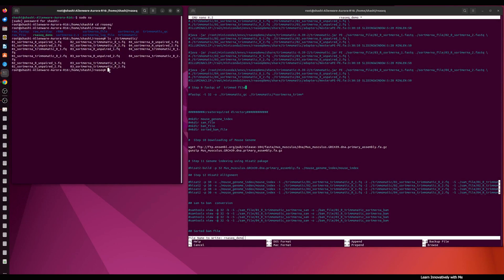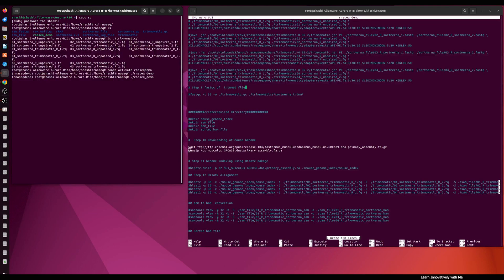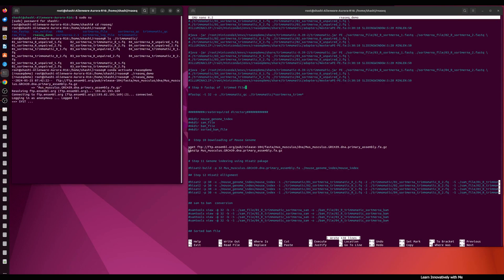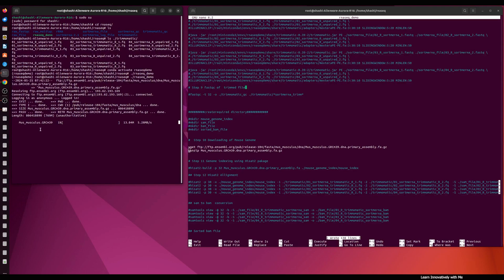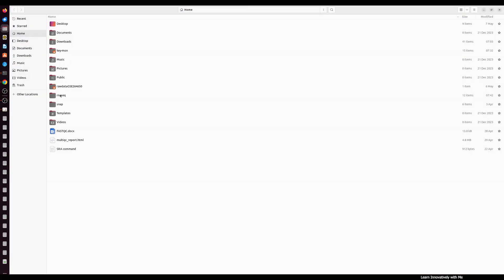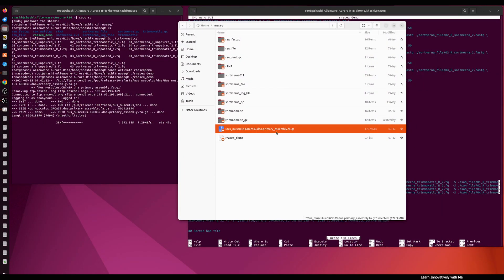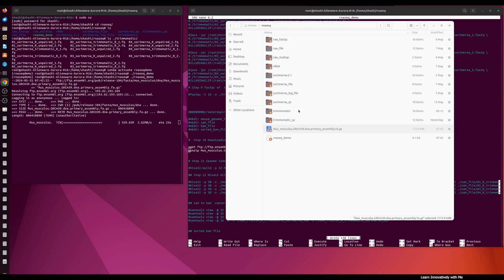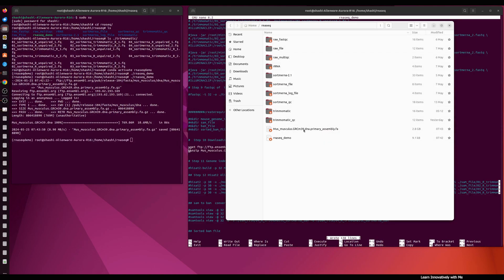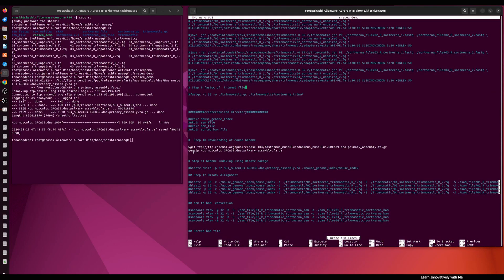First I'm going to activate the conda environment using the command 'conda activate demo' to run the script. You can see the reference genome is downloading. We can check the directory and the reference genome for mouse is downloading right now. The file is downloaded and unzipped because we put the gunzip command after the download. I'm going to comment out this download command in the script by adding a hash.